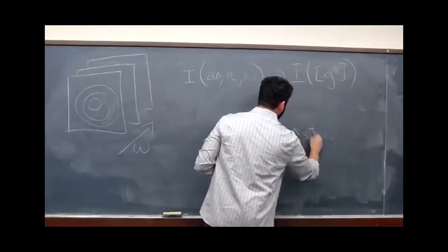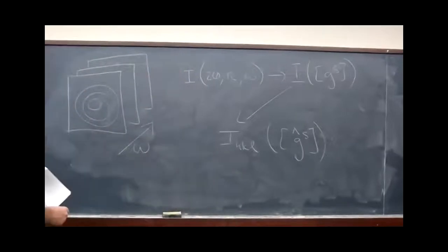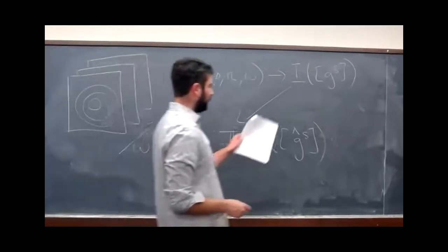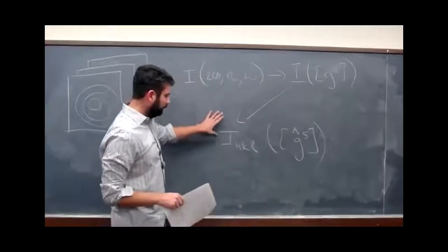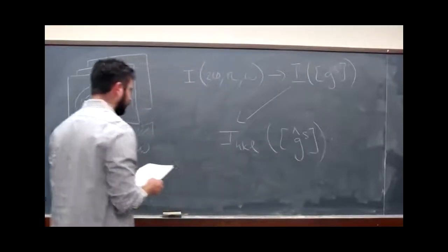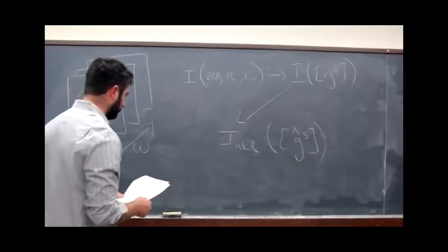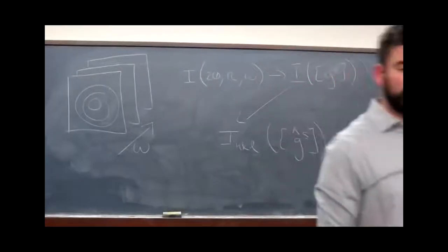So all we have to do is take the unit vector associated with our reciprocal lattice vector. And so we can take our values like intensity, strain, and widths, and plot them each on a unit sphere for each family of lattice planes. And so I've talked about it. It'll be a lot easier to see with some examples.